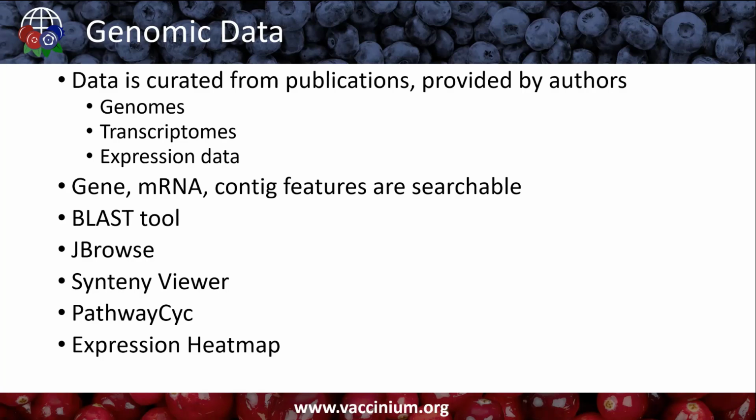We also curate some expression data. If we get the expression data in the proper format, we can display that. And I'll talk a little bit about that a little later.